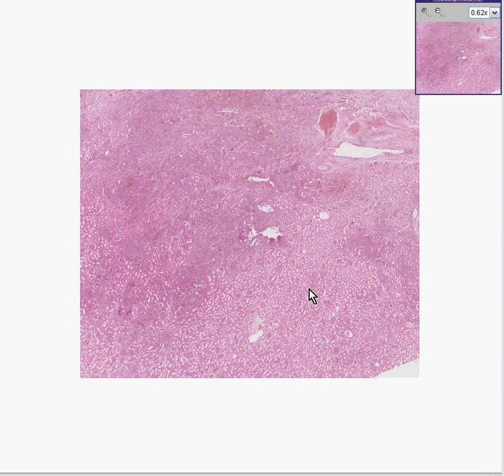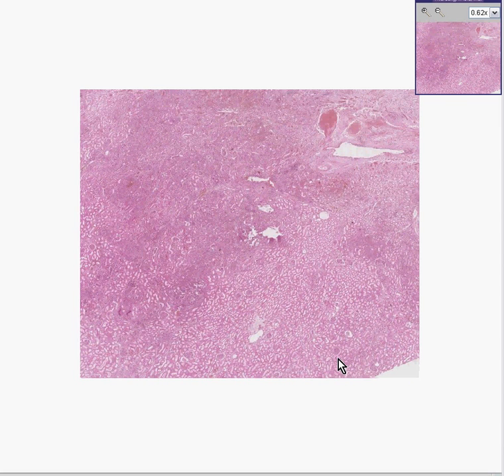Here is another kidney. Even at this power, I bet you would believe that that, and that, and that, and that, and that are glomeruli. Notice, however, that certain areas of this kidney look a little darker than others.